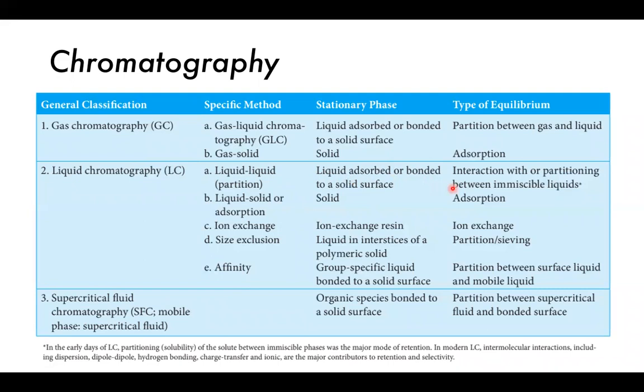And so this was kind of the early form of liquid chromatography. It was based on the partitioning of the solute between two immiscible phases, and this is the major mode of retention. However, now in most liquid chromatography applications, it's really the molecular interactions, including things like dispersion, dipole-dipole, hydrogen bonding, charge transfer, ionic, as the major retention and selectivity methods.